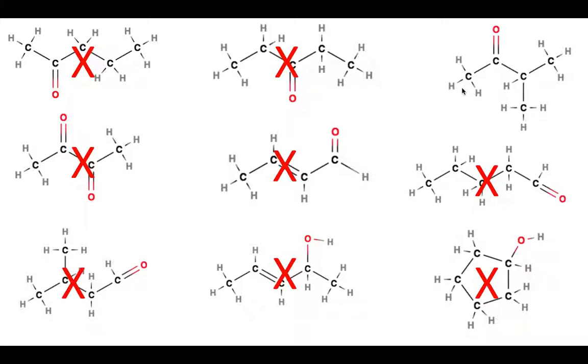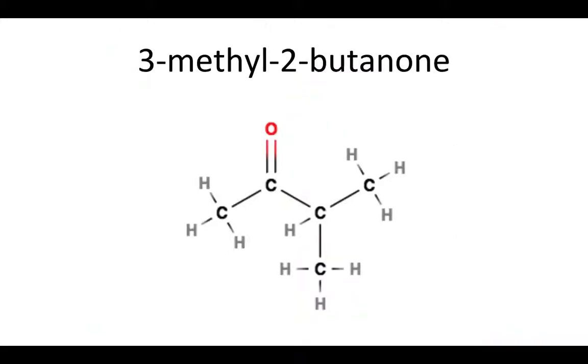Of 61 possible isomers to begin with, we now have it narrowed down to the one structure that is shown by those spectra, 3-methyl-2-butanone. There's no other choice. The mass has to be correct. The types of bonds have to be correct that we see in the IR spectrum. And the number of hydrogen environments, along with how many hydrogens they represent, and as well the splitting, which we didn't really even need to talk about because we had already solved the problem. They all have to be just right. You can't have an NMR that has anything other than 6 to 3 to 1 for the integration.